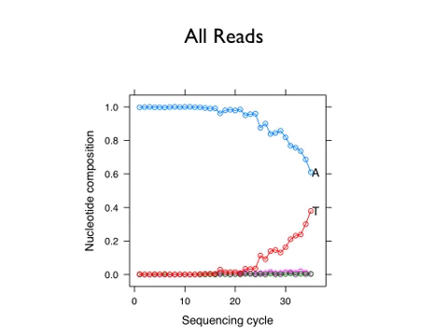No, I mean why along the sequencing cycle does the composition change? Why not just appear at the very beginning? Why is there no errors at the beginning? Yeah. Right. I'm going to explain that a little bit soon. Why is it that it happens at the end? The quality of the intensities worsens as you move along the cycles.